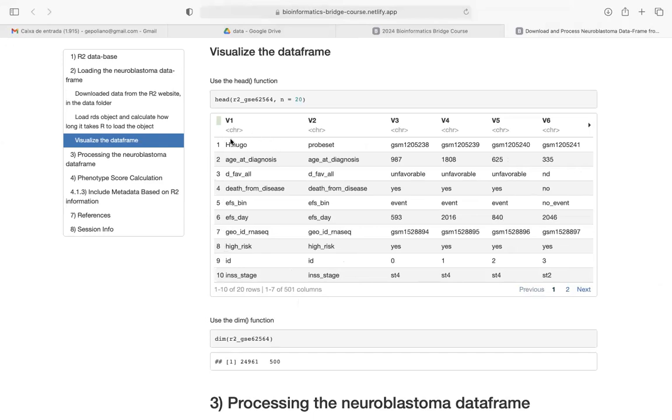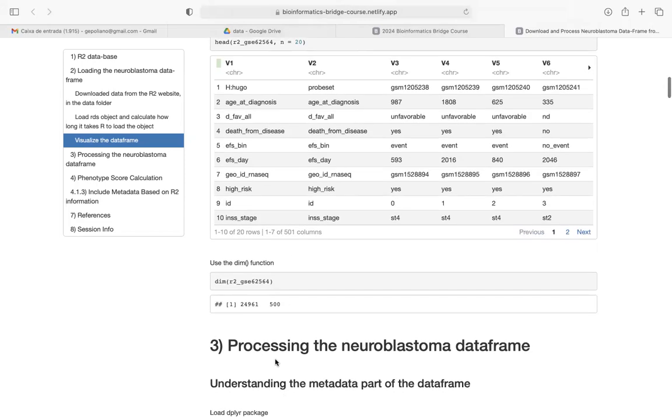So it is actually the 498 tumors of the kids, or 498 kids plus these two columns. Again, what I said is that the GSM IDs are kids' tumor identifiers. Okay, so each column identifies a child, and then there are two extra columns. That's the reason why the dimensions here are summing to 500 columns.